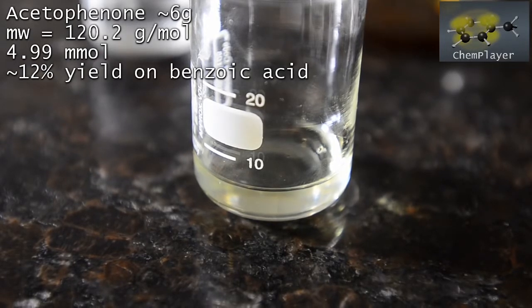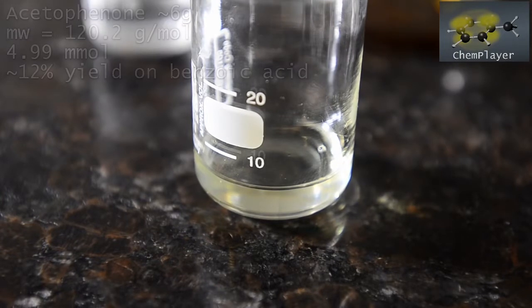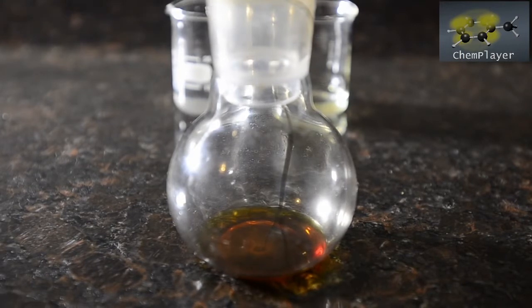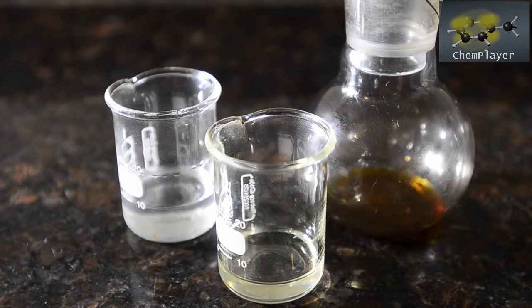Not great, but we'll give you tips later on how to improve this. And finally, the residue in the boiling flask is impure benzophenone, created by the reaction of calcium benzoate with itself. It boils at nearly 300 degrees so a normal pressure distillation isn't possible for us with our setup.